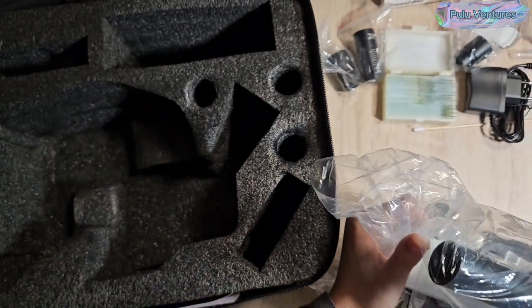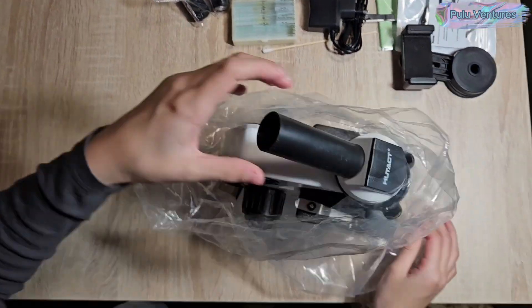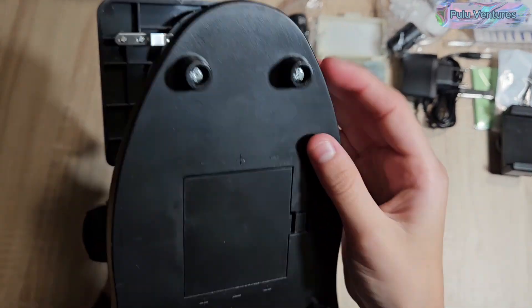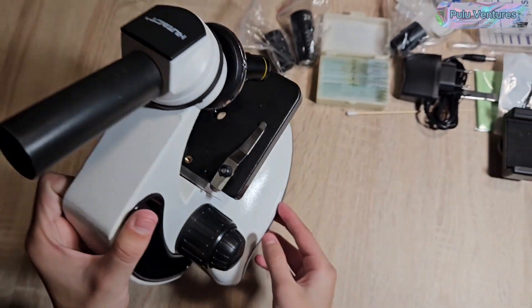It has an upper and lower light, larger screws to move the object holder, and smaller ones to adjust the focus, as well as a knob for the light intensity. It also has cooperative objective lenses — 4x, 10x, and 40x — that provide magnification adjustments.